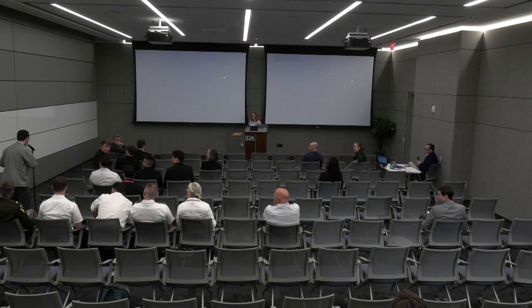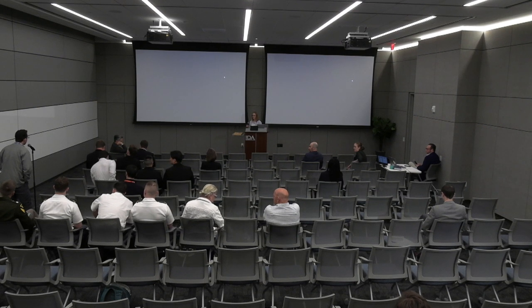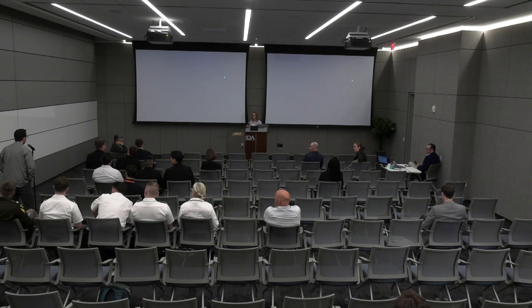Hello, thank you for the talk. Quick question, I've been using Bayesian statistics for a while. Obviously you have to define your likelihood and then the priors. So the question is for people who are not familiar with Bayesian statistics, if the chains are not converging, how does someone in, I guess, geology understand that it's not sampling correctly, it's not converging? I guess how do you impart that type of practical knowledge to them?